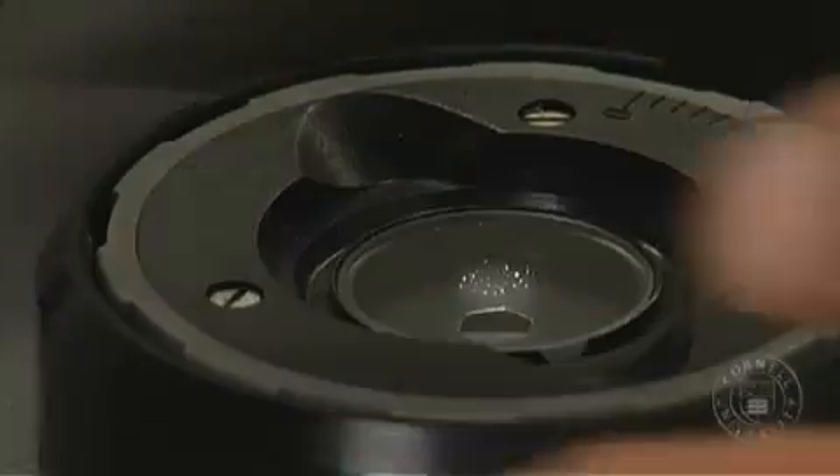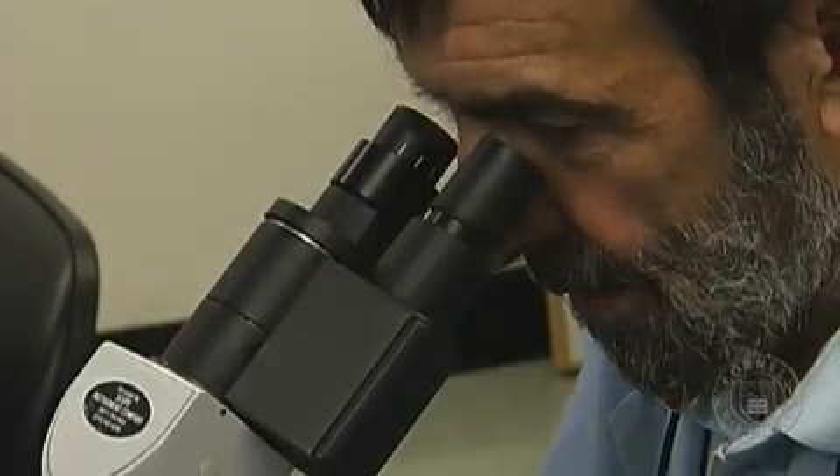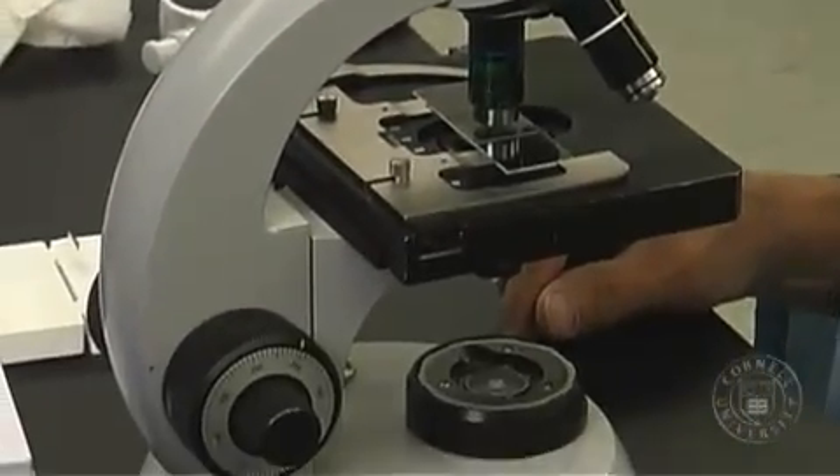I've just checked that the Köhler illumination is proper, and it is. So from here on in, we just have happy microscope time. That's it.